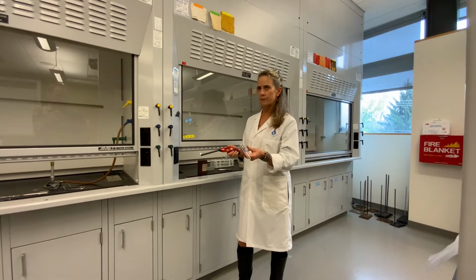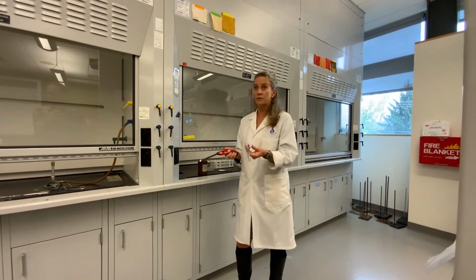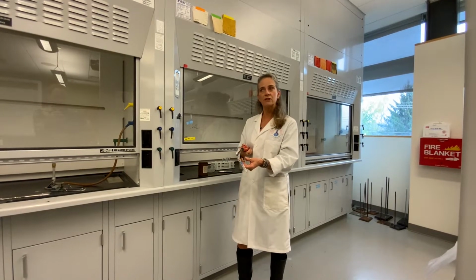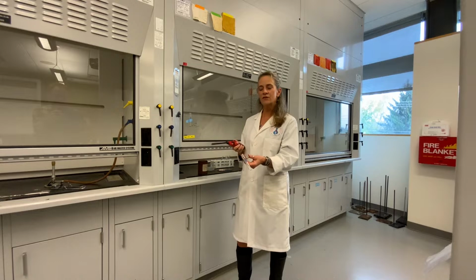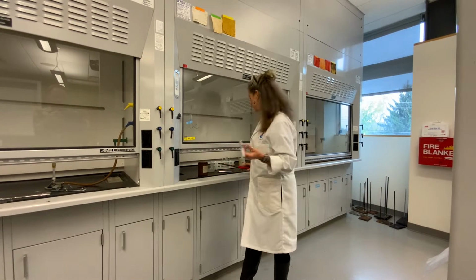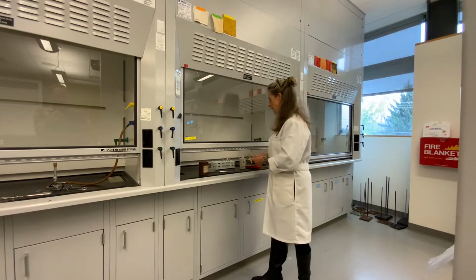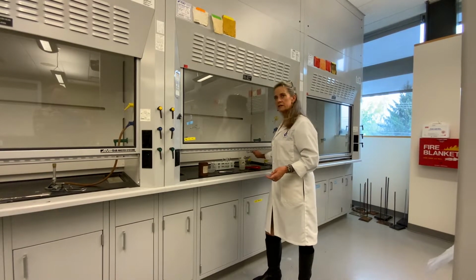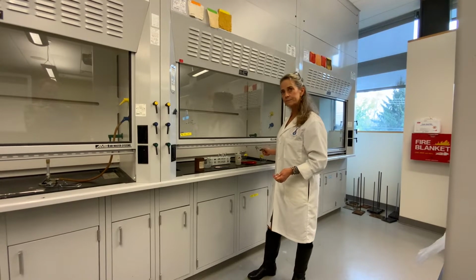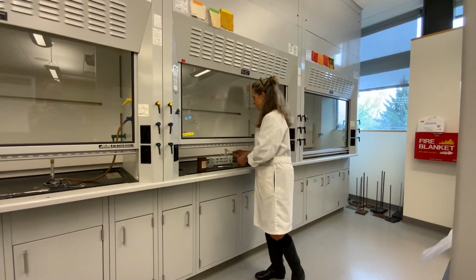As soon as you drop the acid, which you're going to do today, which is kind of cool, you drop the acid in, and then you bring this to the mouth of the test tube really fast. If you do it right, you'll get a pop. You won't be able to hear it on the video, but that's what's going to happen. The waste goes in here, so you're going to dump it in there, and the test tubes can go in here. Got it? Okay.